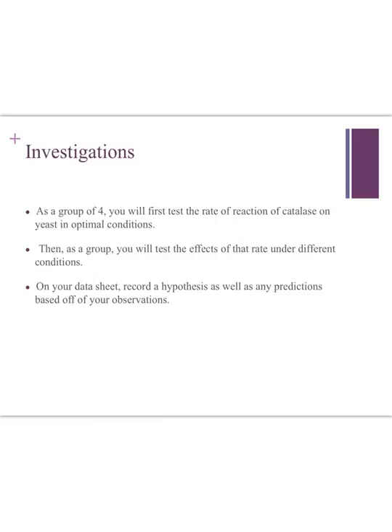So as you know, enzymes normally have their own optimal conditions based on the particular enzyme. And this is a specific temperature, a specific pH. And what we're going to investigate is how the reaction will change when you change these optimal conditions.